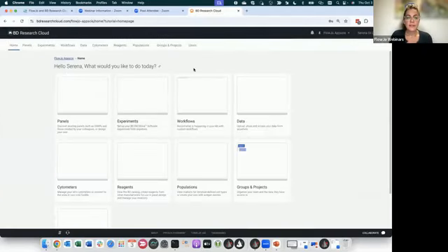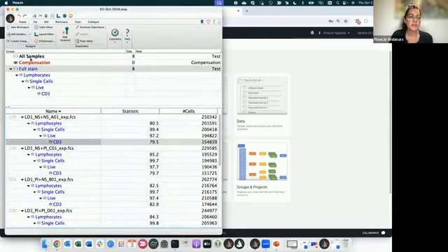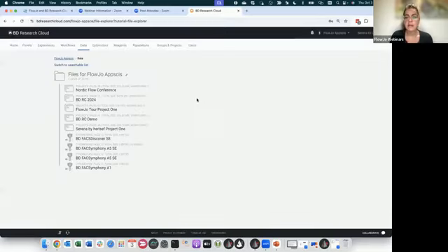One more thing that you can do with that BD icon in FlowJo is to load data. If I open up my FlowJo now and I want to add some samples, I have the option to add samples from BD Research Cloud. That will automatically connect me with my storage area of BD Research Cloud, which is this one, where I have all my data and different projects that I share with people, and I also share my data with them eventually.